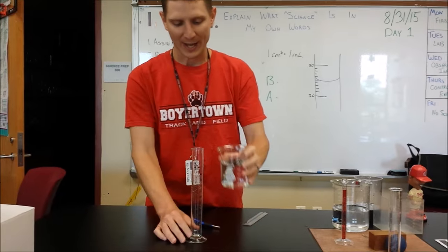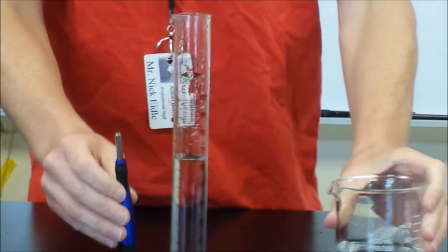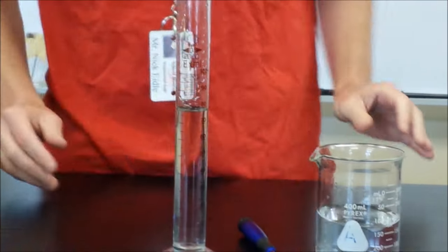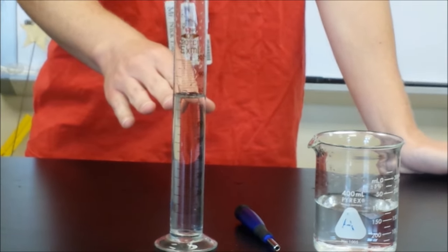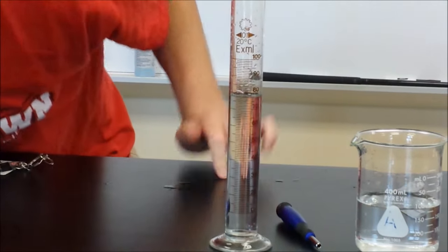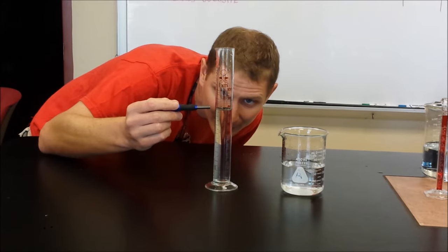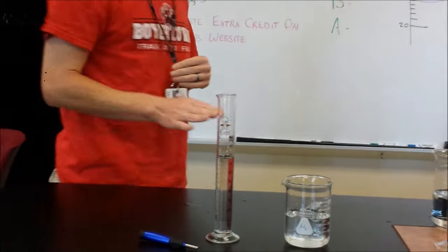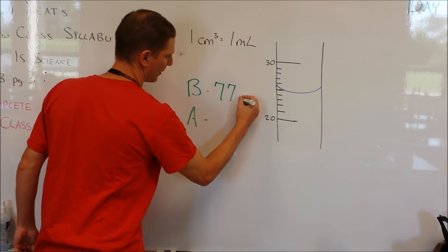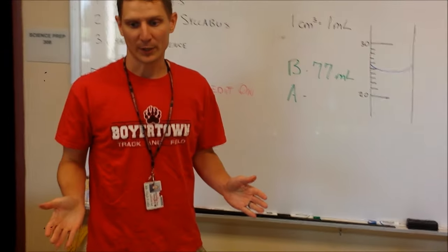So the first thing we're going to do is just add some water to our graduated cylinder, and just need to make sure that it's above or higher than your object. We need to record this volume. This is going to be our before volume. So we're going to get down eye level with it, and we're going to try to record the volume, and this looks to be about 77 milliliters, and we need to record that. So that's our before volume.